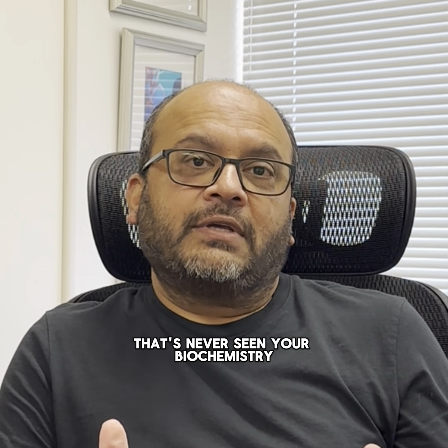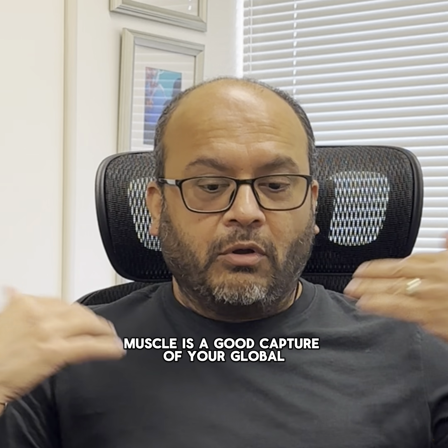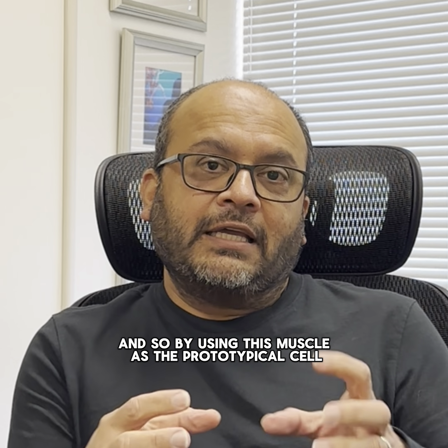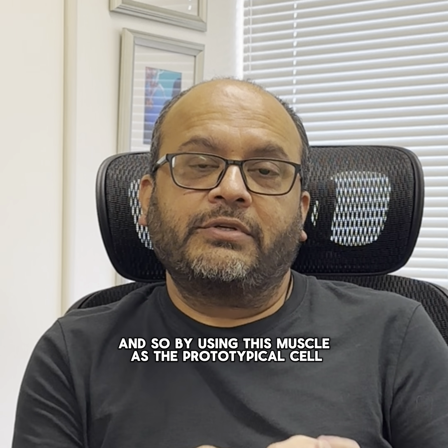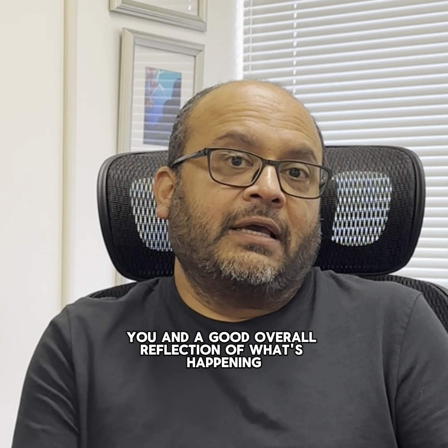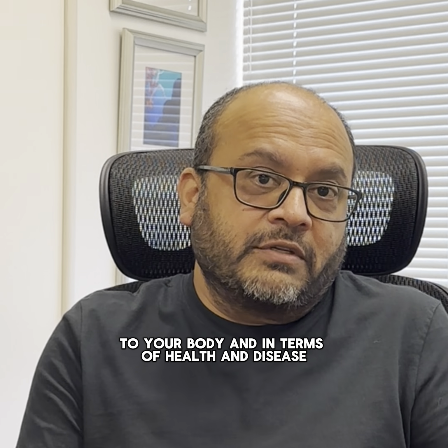So we take a muscle cell that's never seen your biochemistry and we add it to that muscle cell. Muscle is a good capture of your global metabolic health because we have a lot of it and it consumes a lot of energy. And so by using this muscle as the prototypical cell, we get a clean assessment of what's happening inside you and a good overall reflection of what's happening to your body in terms of health and disease.